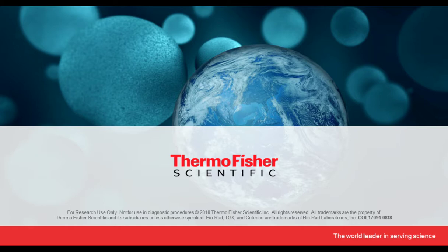Or in some instances, customers do reuse the gel running buffer. The problem with reusing the gel running buffer is when you have fresh running buffer, your ion concentration is 1x, and when you run, everything is in good proportion. Now, when you are reusing it, the buffer ions are depleted. So you don't know to what extent they are depleted though, and it can vary between every run.